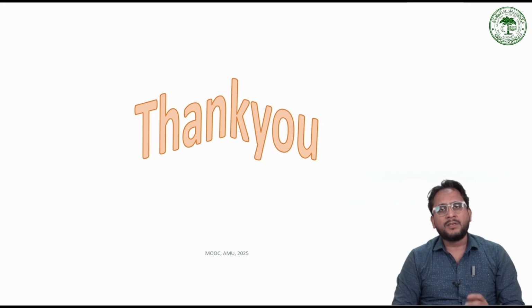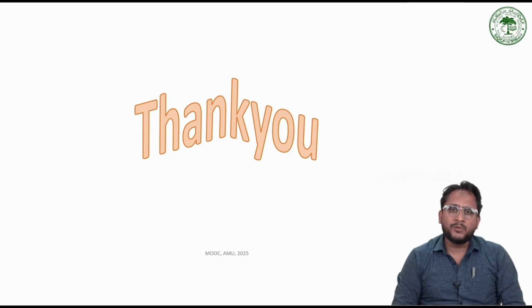I hope after attending this lecture, you have got an idea about the concept of atomic absorption spectroscopy and its two main components, the nebulizer as well as the atomizers. In the next lecture, we'll discuss the light source as well as the monochromator and detector.